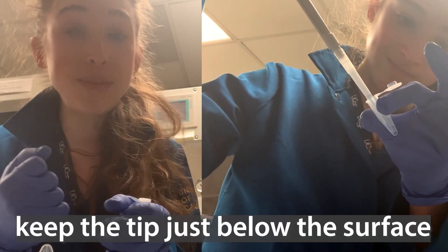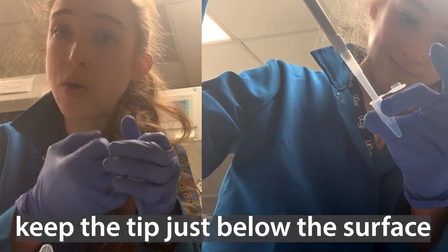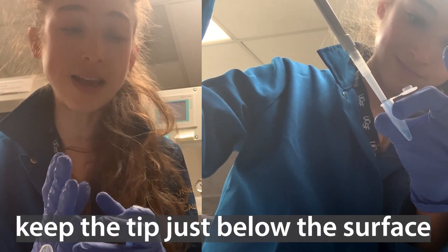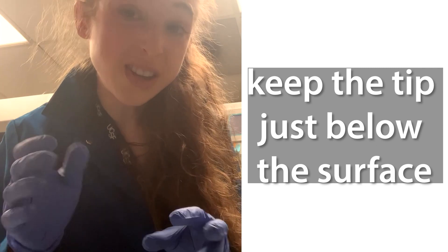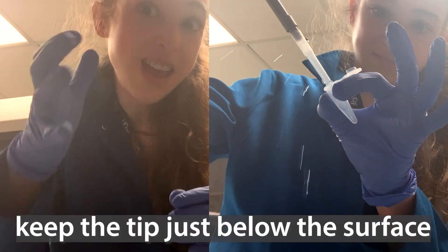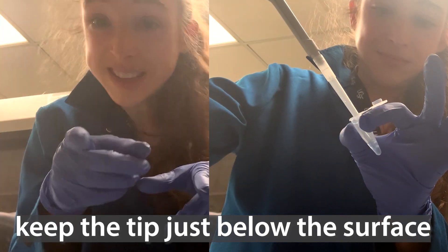Don't dip your pipette tip too deep into the liquid — just on the surface — and then go up and down with it. You don't want to get stuff stuck on the outside of your pipette tip. Also, be sure that you don't push your pipette tip too far in and have things spill out the top. That's not good either.